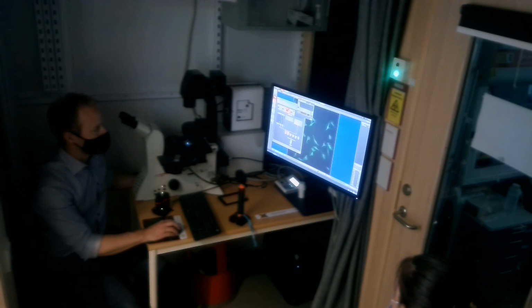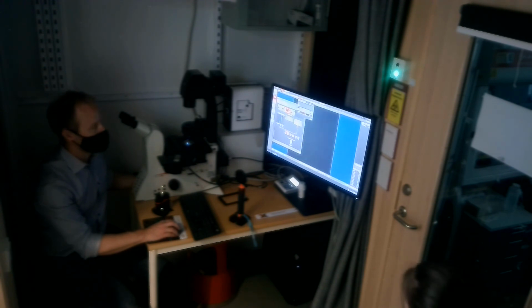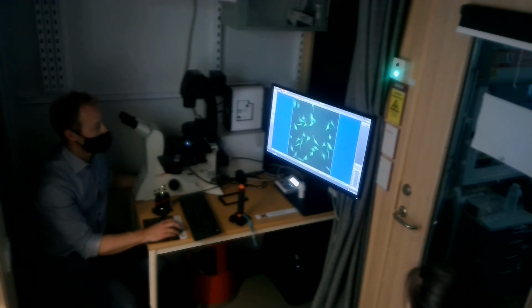Also here you have the rescaling if you want. So I can make sure that all the things that I said before, adjust exposure time, adjust the light intensity, and adjust the scaling, in a way that you get something that is reasonable to what you want to capture. So that's absolutely possible to do here.